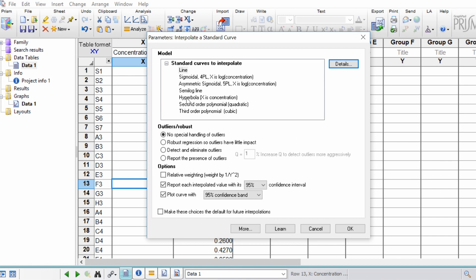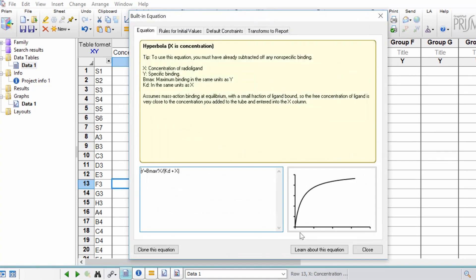It's more a hyperbola relationship. Now this is where the X values are the concentrations. So if I click the details button, this is the kind of relationship my standard curve represents. So this is the one that I'm going to use.